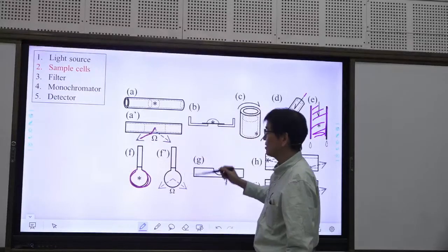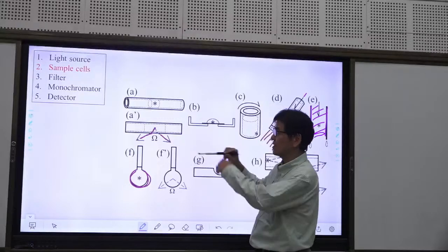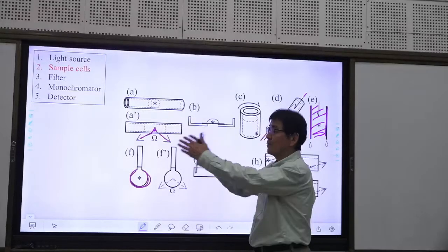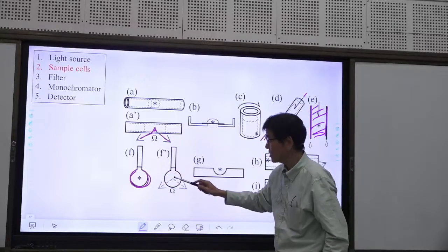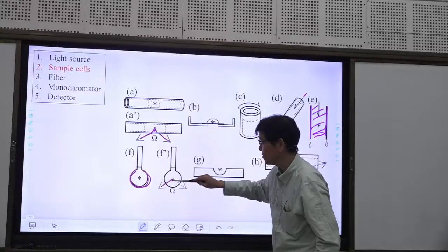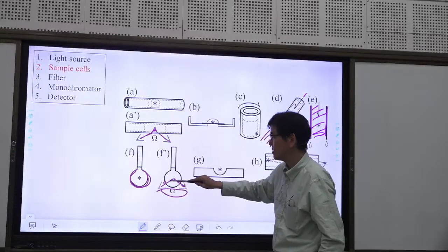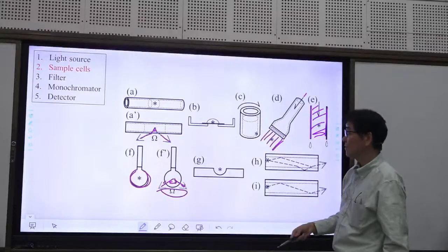So even if we prepare a large numerical aperture lens, only limited solid angles can be covered by this lens. If we use round lens, this kind of refraction does not occur, it goes straight because it's normal. Then we can cover larger range with the same lens. So it's advantageous.